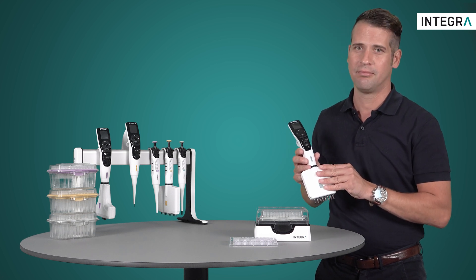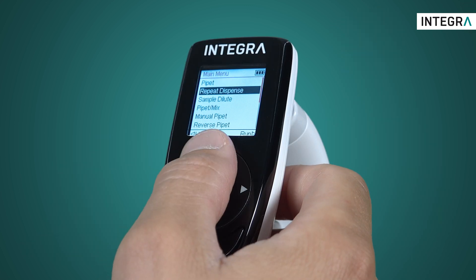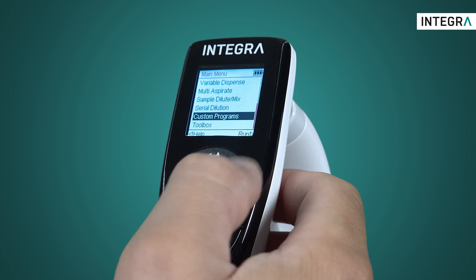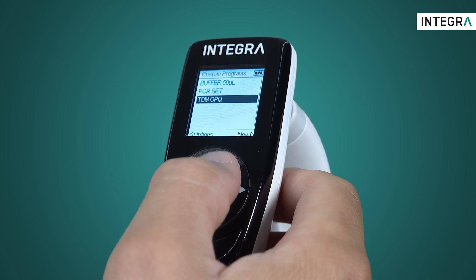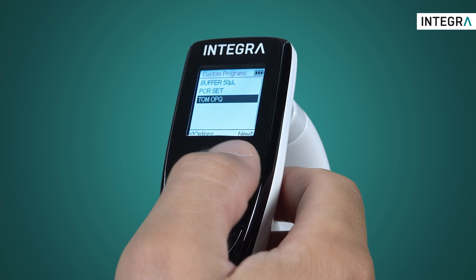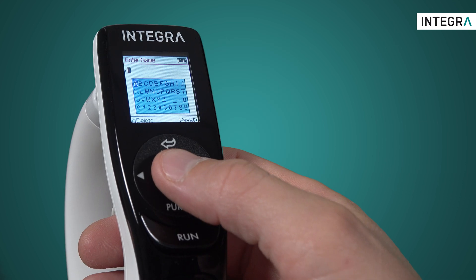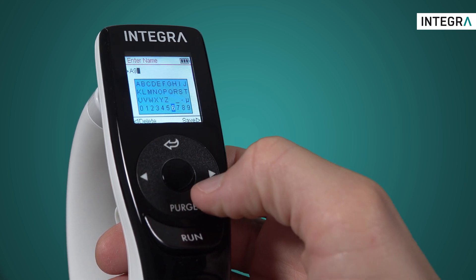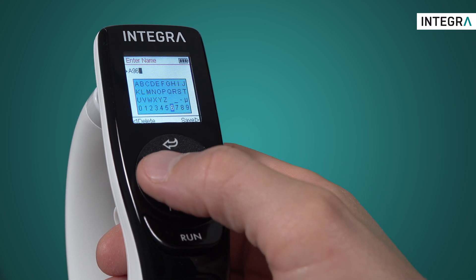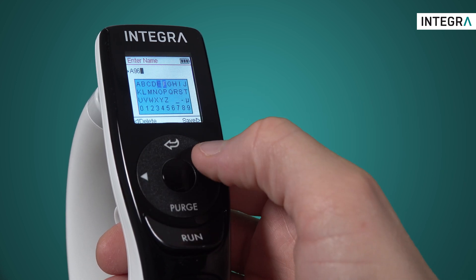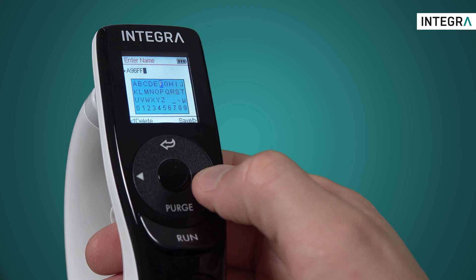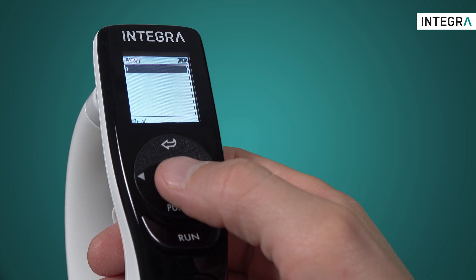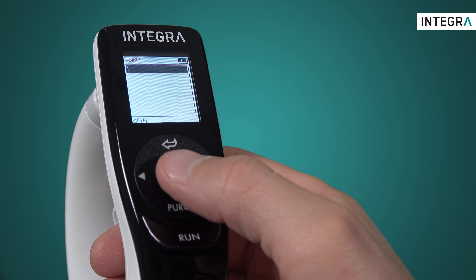Here's how it works. Simply enter custom from the main menu. Here, you can see a list of already created programs, but let's make a new one. I'm prompted to give the program a name, and I'm now free to enter all the steps I need to create my own program.